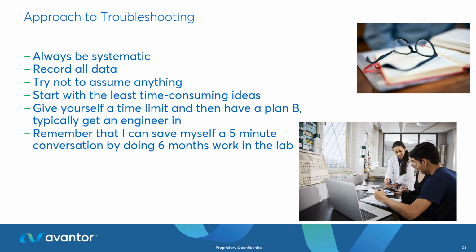Always have in mind a plan B, and that plan B may be an engineer, but specify a time limit on this so that you're not wasting valuable analytical time trying to fix a problem that may be outside of your knowledge ability. And this is a quote that I got from one of my mentors some years ago, and I thought it quite a nice quote.